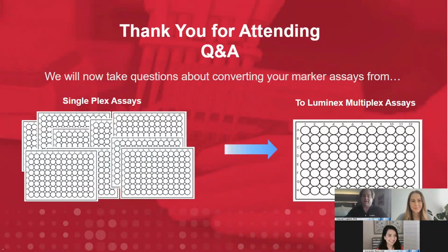Well, Jackie and I said there's lots of them, actually. Most of them are proteomic. There are, like I said, one manufacturer, Thermo, does make some genomic assays. And they actually have quite an extensive library of genomic targets. And their chemistry can be used for looking at transcripts, so they can look at gene expression levels. And they can also look for specific, say, genomic or DNA-based sequences.